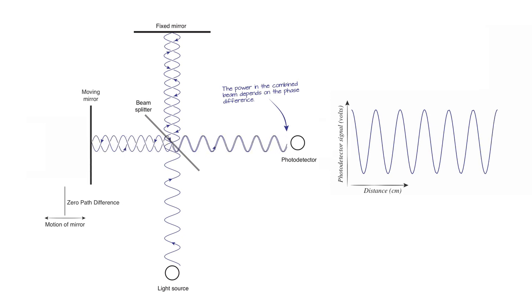Just an oscillating power signal. Now, if I just shone that laser on the photodetector, all I would get is just, hey, lots of power. We just get one single number, it would stay the same. Lots of power till I turn it off. But using the interferometer, I can turn that power signal into an oscillating power signal with the same wavelength of light.